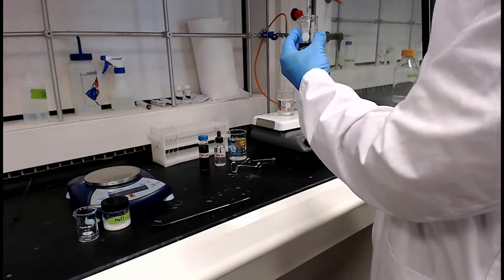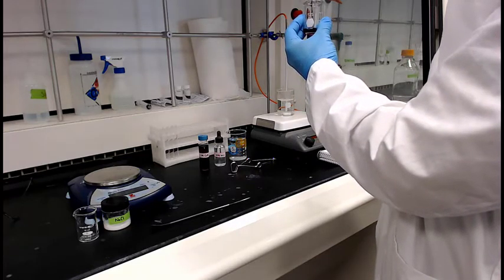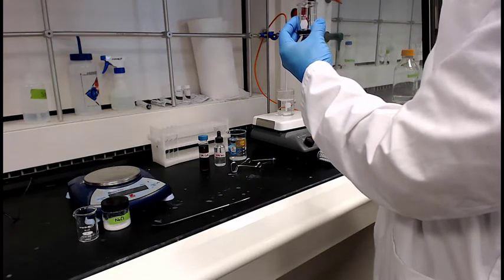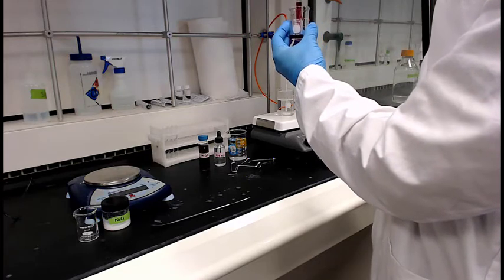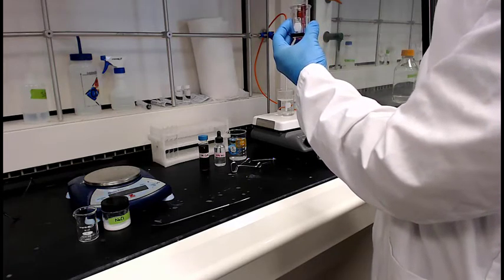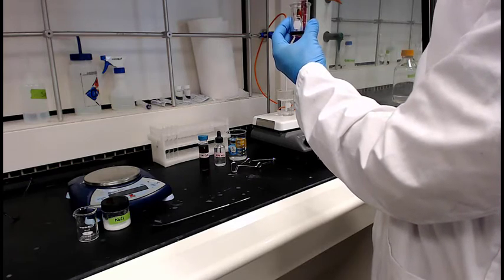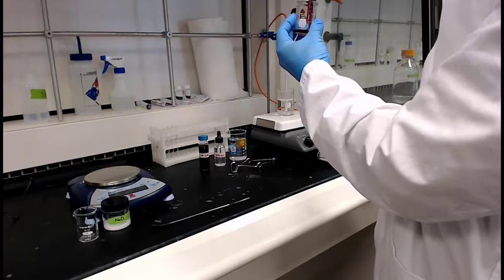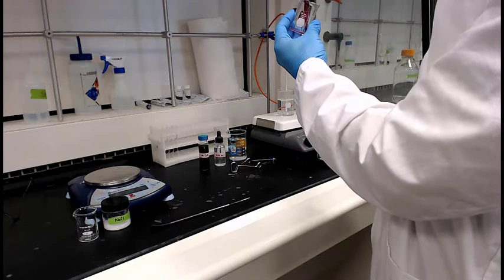And again, if you're taking screenshots of this, you don't want to take the screenshots when it's in the beaker or in the volumetric pipette, because it looks, and this is a good example, see where he pulls it up and it gets in that thinner tube? It looks like it's more dilute, but it's not. It's just that you're looking through less width of the fluid. So if you have less path length for the light to travel through, it's going to do less absorbance, if you can think of it that way.